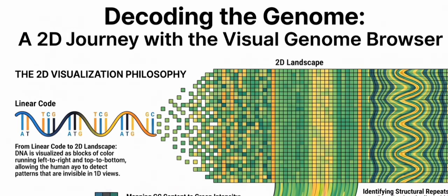So a conservative missense mutation would be like swapping one Lego block for a different Lego block of the exact same size and shape. Precisely. If a variant swaps a small hydrophobic amino acid for another small hydrophobic amino acid, the overall 3D folding structure of the resulting protein probably won't be severely impacted. The software flags this as a conservative change.